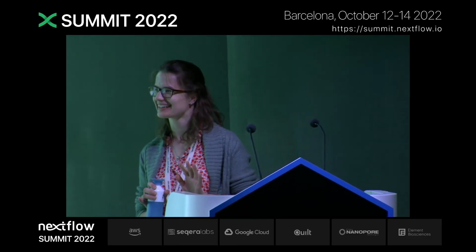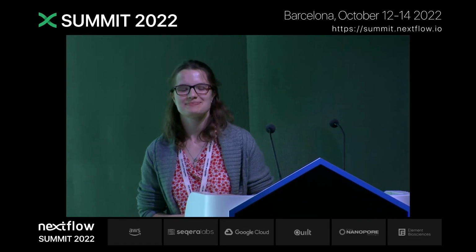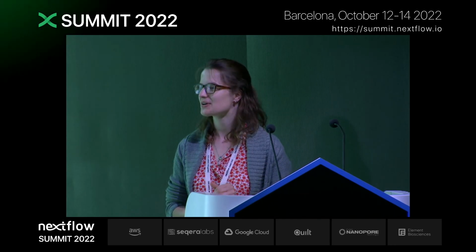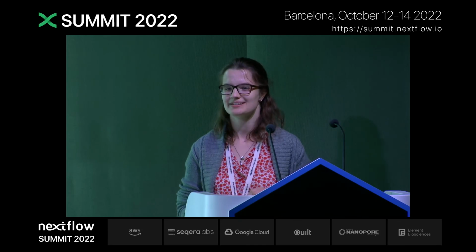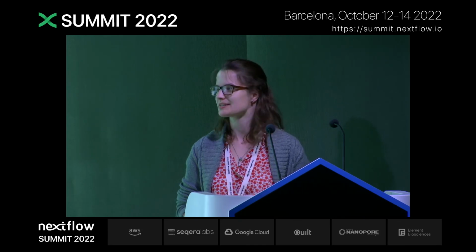That's a hot topic. We've done some benchmarking internally for germline variant calling, and there Freebayes has performed the best for us. Also DeepVariant has been performing really well, but I mean, they've all been performing really, really well. It's like minuscule differences between them.